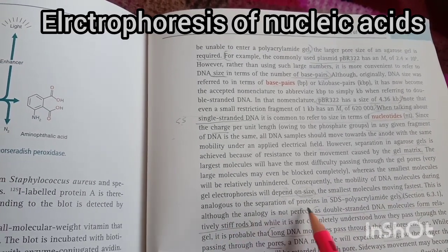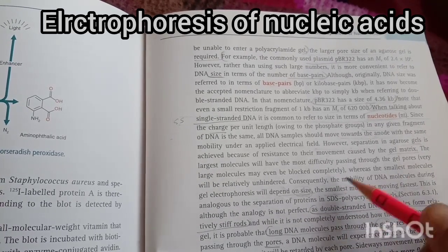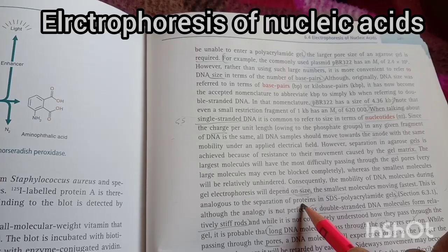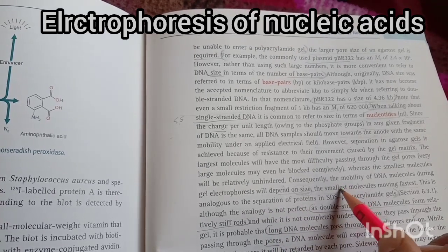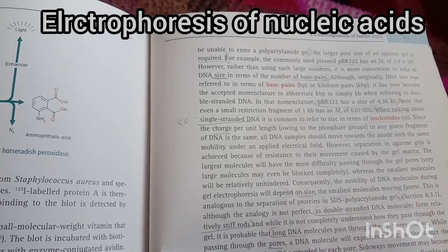On the basis of size, the smallest molecules move faster. This is analogous to the separation of proteins in SDS-PAGE. It is the same in proteins: the smaller size will move faster and the larger size will move slower. This is analogous to the protein sample.